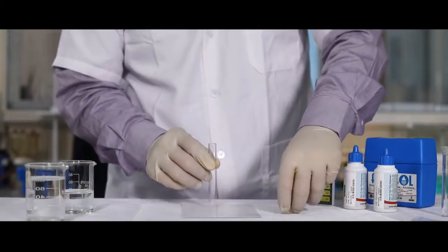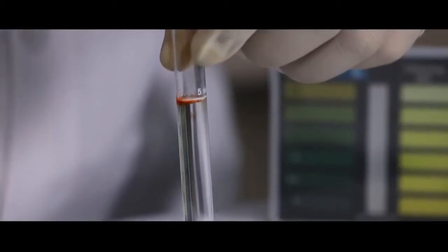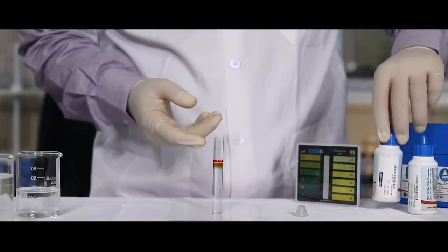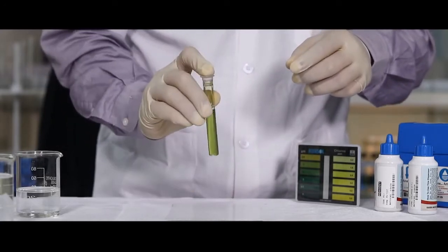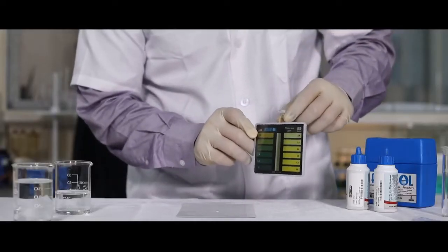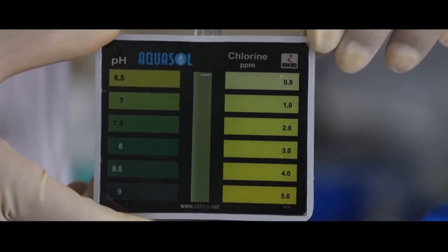Take the comparator tube provided, fill the tube with the sample up to the mark. Add 15 drops of pH 1 reagent. Close the cap and mix well. Place the test jar in the comparator slot. Match the color to the color shade to know the value of pH. Hold the comparator vertically against the light at eye level.